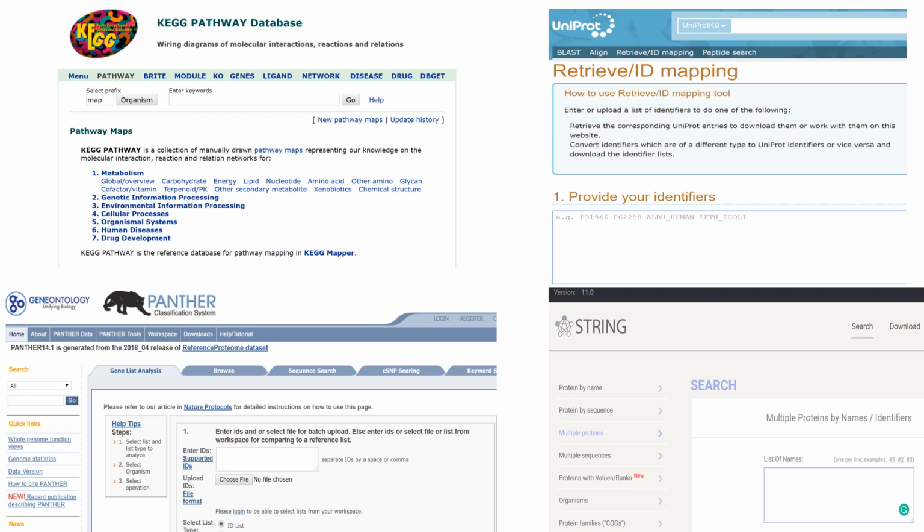What PANTHER does is categorize the proteins into separate sections based on their functions, but at the end they always use the UniProt database as well. PANTHER is useful when you have a large, massive data set, since they can categorize and you can select based on those specific categories. Since we are using a small set of data and we couldn't get that much protein out of it, I opted to use UniProt because that's pretty user friendly compared to PANTHER.